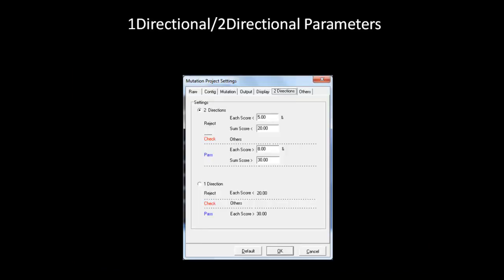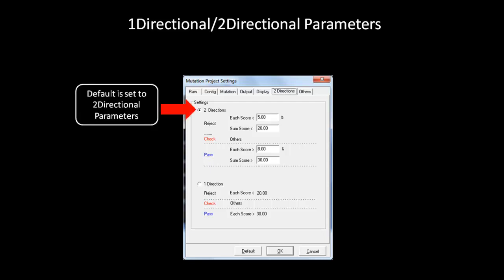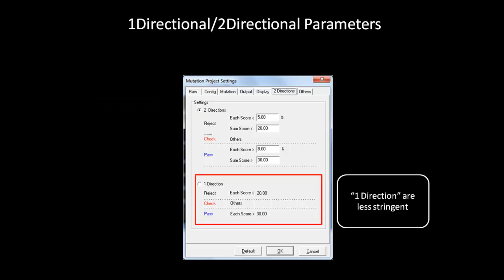You can change the parameters of Mutation Surveyor to optimize for analysis of one directional or two directional data. In the two directions tab, the default is set to two directional parameters. If you are analyzing one directional data, either forward or reverse strands only, then these parameters might be too stringent for the analysis and can filter out many mutations. Make sure you select one directional parameters when analyzing only one directional data.